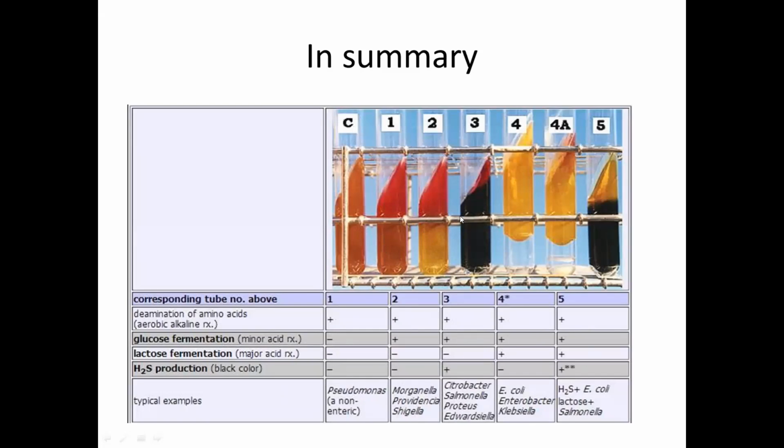Here they are strong lactose fermenters, but later turn into others. But Citrobacter has different varieties. Just keep in mind it's an H2S producer. E. coli, Enterobacter, and Klebsiella are there. Some E. coli produce H2S, but at this level we are not expecting this.